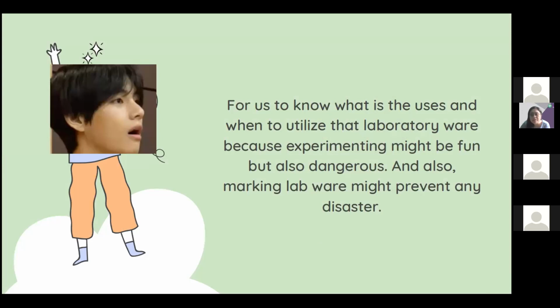As in, there are chemicals that should not be mixed together because they might cause reaction like explosion. Naglisod taan na sa laboratory ko na explosion, no? And that is also to prevent other types of harms or risk inside the laboratory. And at the same time, for us to have the correct result of the experiment. Tama ang atong ipaghalo kasi they are properly labeled.